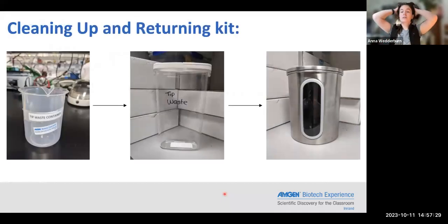Because this is a really important part of the kit loan, especially if you are loaning kit from one of our remote centres, because the way you leave the kit will be how the next teacher will pick it up, as we won't be there in between. So in terms of tips, all the used tips that you've used during the classes, they get the students to empty.